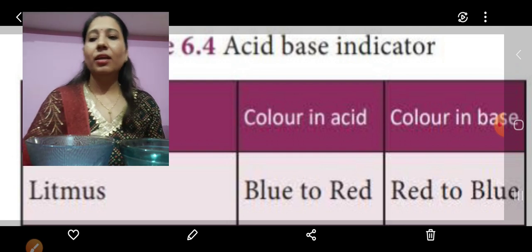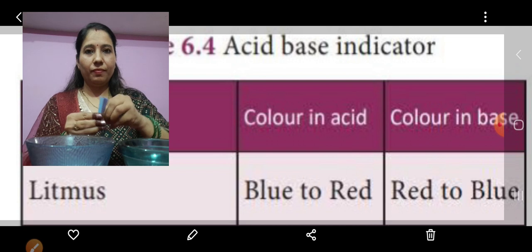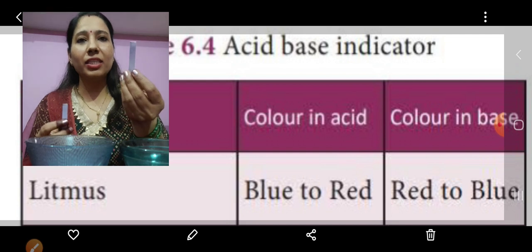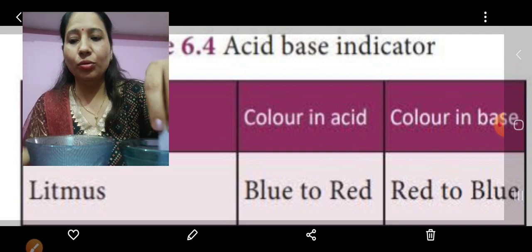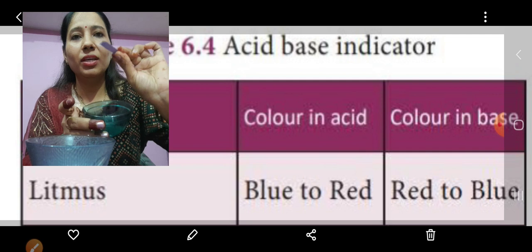Now let us see what the blue litmus paper does with these solutions. I will take two more strips. Now I will take this blue litmus paper and dip it in the baking soda solution. Is there any change? No, there is no change.